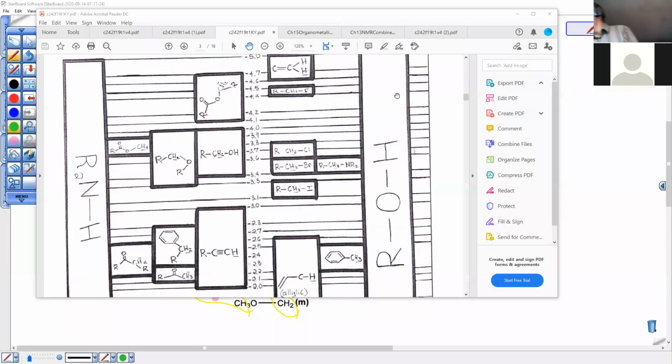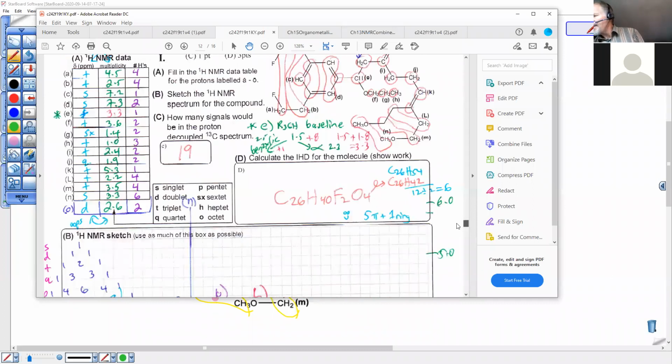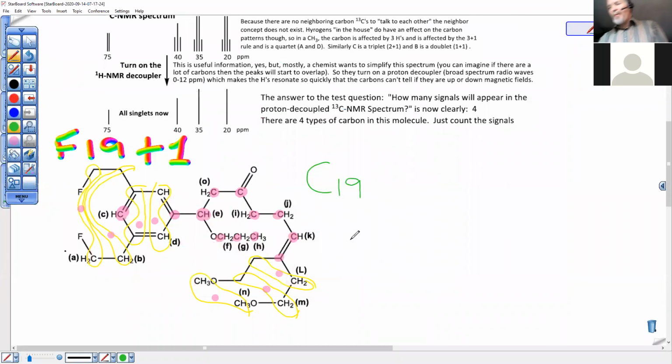And we're sharing. We're on our NMR sheets here, going down. There they are. And it looks like we have 19, so we got the answer key there too. I think we got it right. Okay, that's worth a point. 19 carbons. So that brings to a close this segment here.